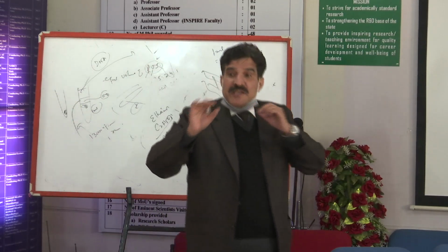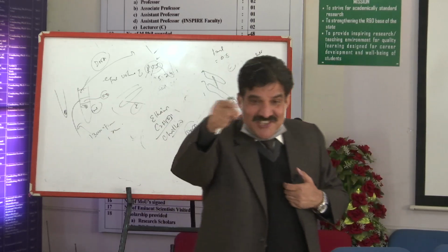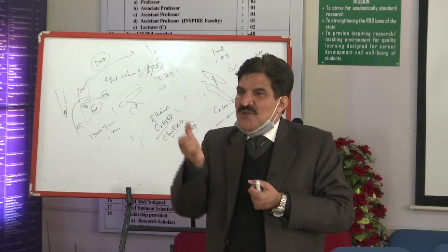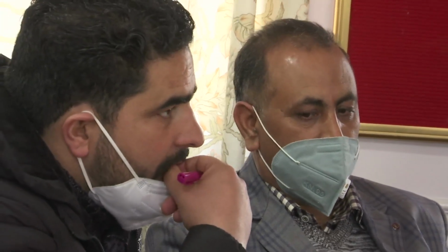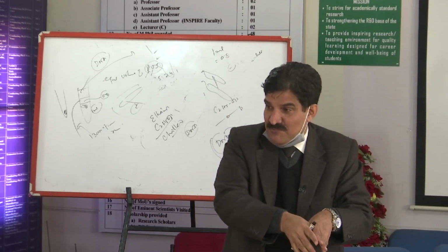Some people can see it with their eyes, the cotton-like fibers produced there. You can directly take that out by cutting the nose of the tip and taking it out, keeping it in a separate tube. It will be the purified one, because others will be within solution, some components.